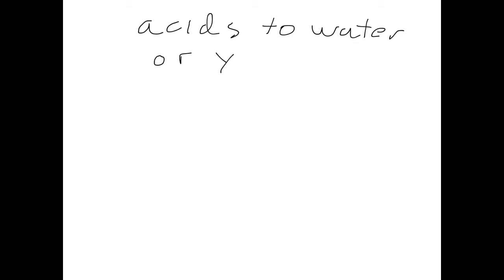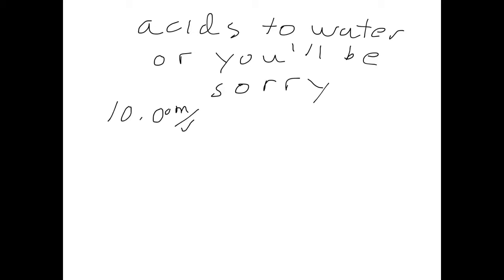If you're making a solution that involves an acid, remember your safety rules: add acids to water or you'll be sorry. If you're wanting to make a solution that's 10% mass volume hydrochloric acid and water, what you would do is follow the same procedure with one important safety exception.